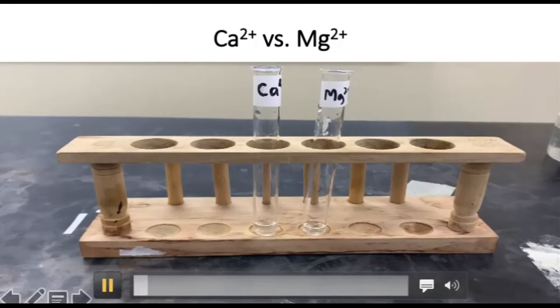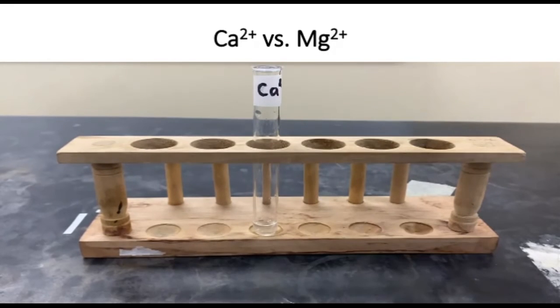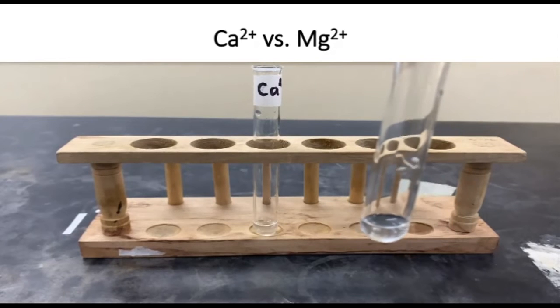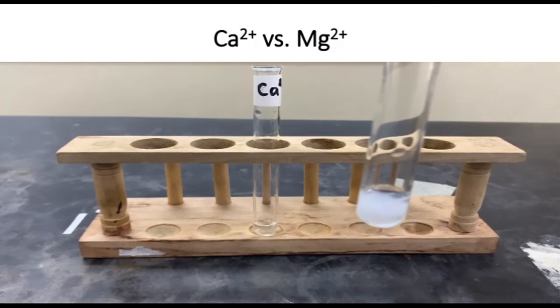We just got a white precipitate with sodium hydroxide, which did not dissolve. So now we're going to use aqueous ammonia to see if we can distinguish between the calcium ions and the magnesium ions. We're going to start with magnesium, and we're going to add a few drops of aqueous ammonia to our magnesium ions in solution.